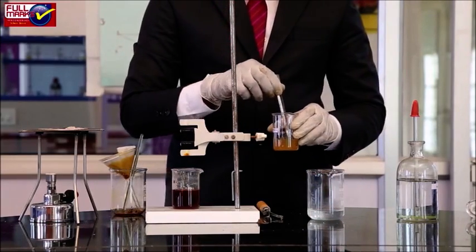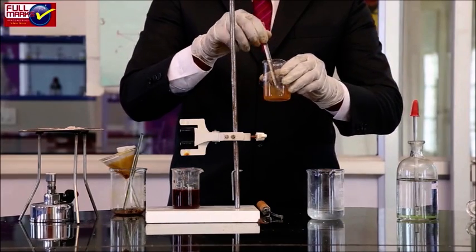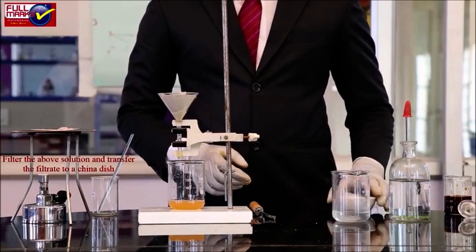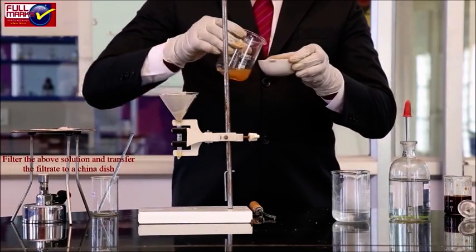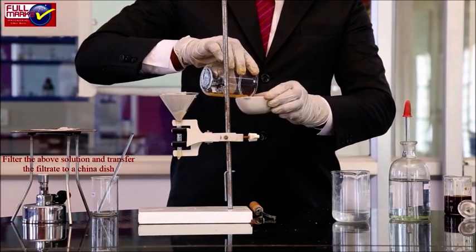The precipitate will dissolve. If the precipitate doesn't dissolve, warm it and leave the contents for some time. Concentration of filtrate and formation of crystals: Transfer the filtrate to a china dish and heat it on a wire gauze kept over a tripod stand until the crystallization point is reached.